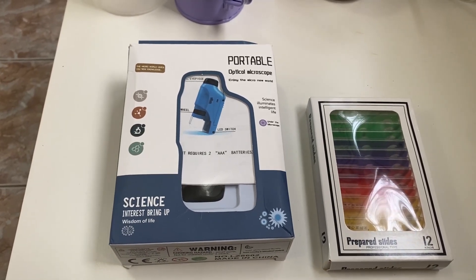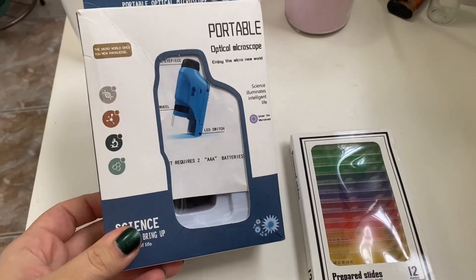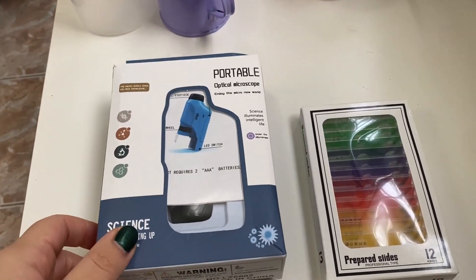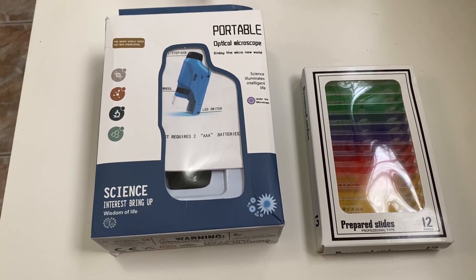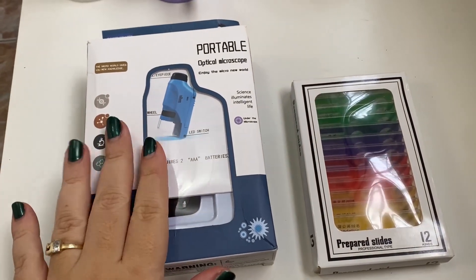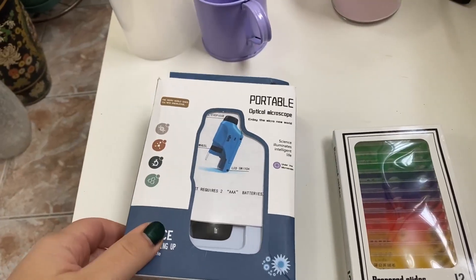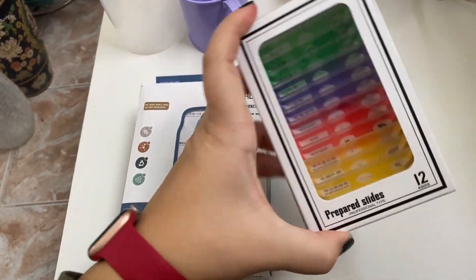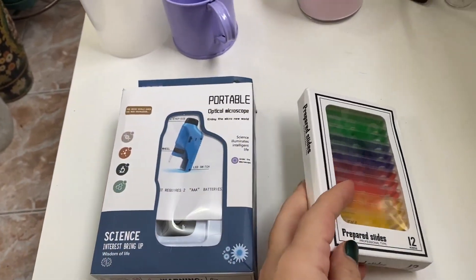In today's video we will be testing this portable microscope that I got from AliExpress. I got it for $15, but it also had a $2 delivery fee, so $17 total. As you can see it's a small package, and these are prepared slides with different samples that I can use with the microscope.